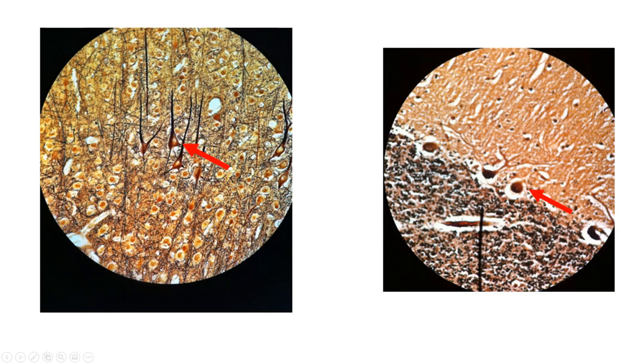Then these are Purkinje cells—not Purkinje fibers, Purkinje cells. Purkinje cells are found in the cerebellum of the brain. Again, if the cerebellum doesn't make sense to you, it's just a part of the brain. Just know that these Purkinje cells are found in the cerebellum.